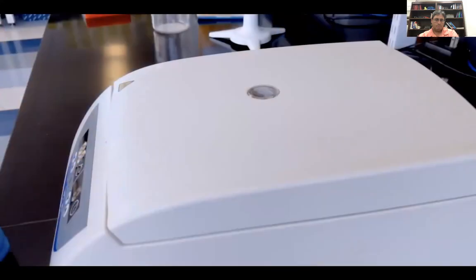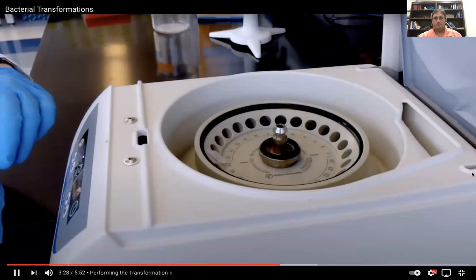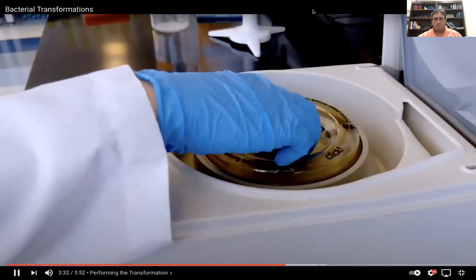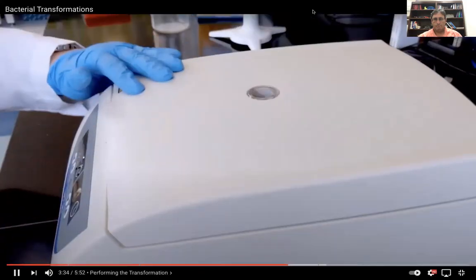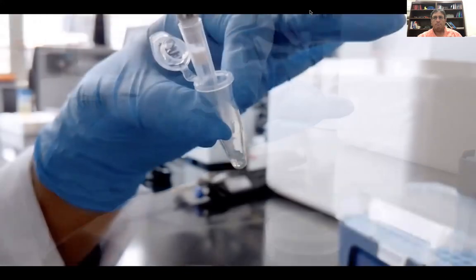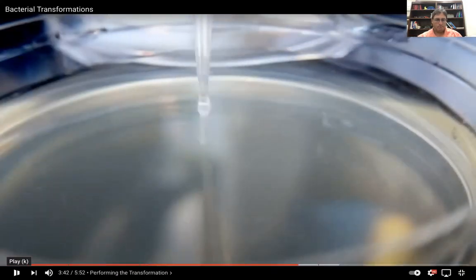To increase the number of colonies you get after plating, you can concentrate your cells after the outgrowth step by centrifuging. We usually centrifuge the cells for 5 minutes at 4,000 RPM or 1,500 Gs. After you've removed some of the supernatant, you can resuspend the cells and pipette them on top of a warmed LB agar.